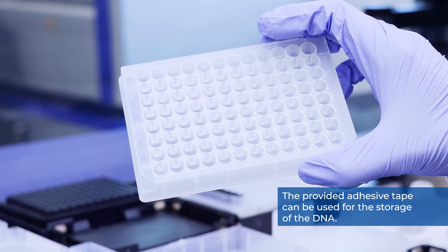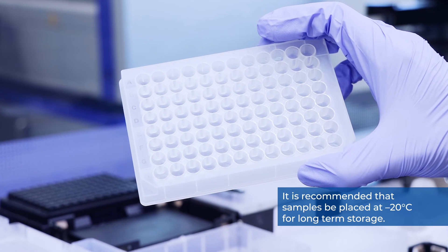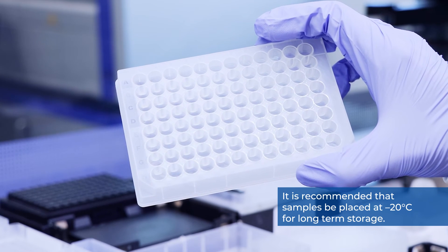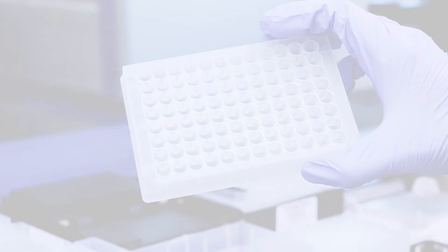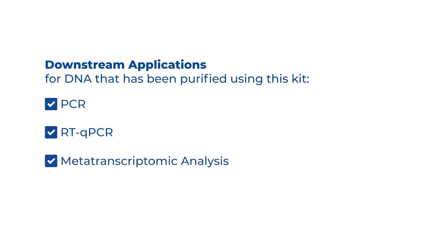The provided adhesive tape can be used for storage of DNA. It is recommended that samples be placed at negative 20 degrees Celsius for long-term storage. DNA purified using this kit can be used in PCR, RT-qPCR, metatranscriptomic analysis, and metagenomic analysis.